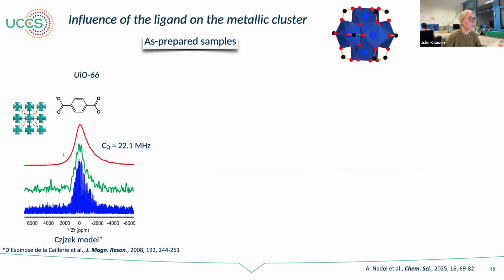Then another question. You've been working with the D-HMQC experiment that is very similar in terms of obtained structural information with HETCOR. Which one do you prefer, and what are the main advantages of each compared to the other? Usually we use HETCOR between spin-half nuclei, and we use D-HMQC when a quadrupolar nucleus is involved. The HETCOR experiment is easier to set up, but it's between two spin-half nuclei, proton and carbon-13.